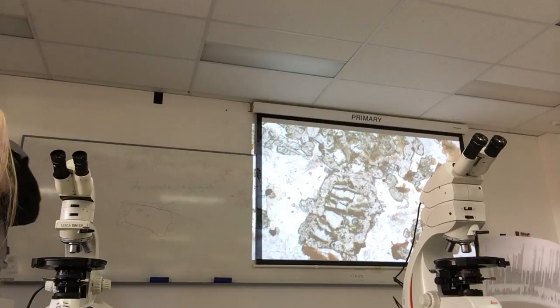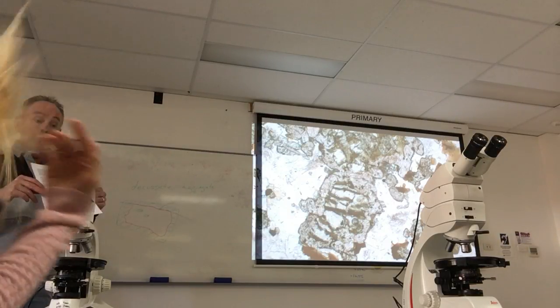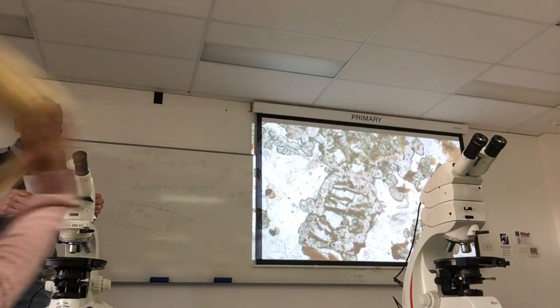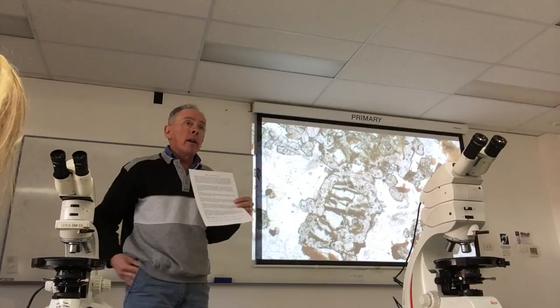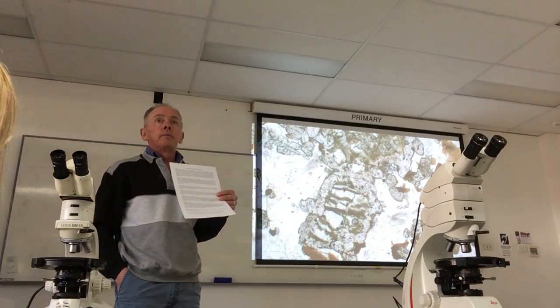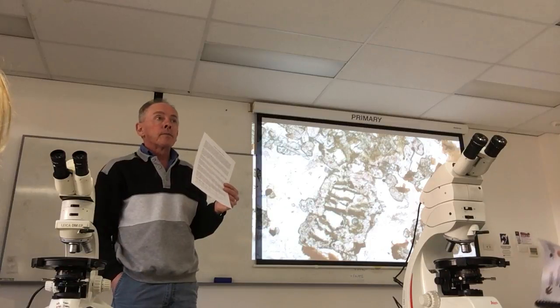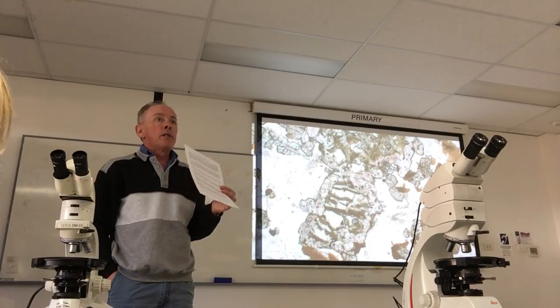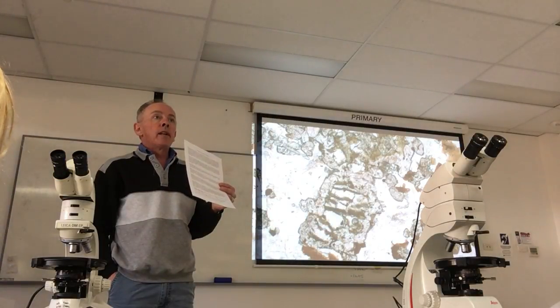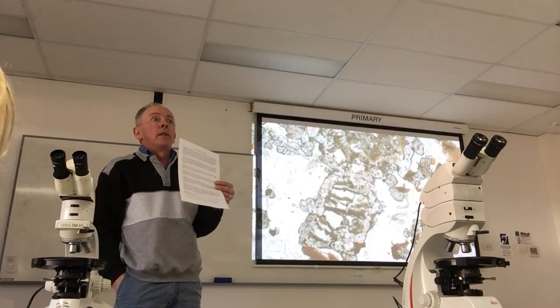And keep that in mind. There's one of the slides you're looking at today, the basalt. There's a description of it in the back of your book there, and it's only a couple of paragraphs. It's quite a simple one, because most basaltic rocks are fairly simple. Remember, they're the two P's. They're the pyroxene plagioclase rocks. You may or may not have olivine, and the other little bit of odd, you may or may not have quartz sometimes.